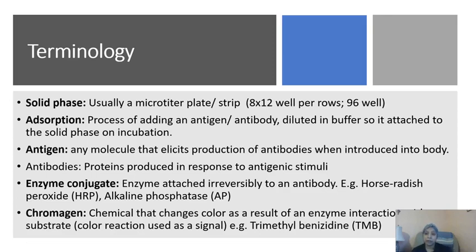So that's the protein of interest in our case, or the part of the protein that we care about. And then our antibodies are going to be the ones that are produced, and that is what we're going to be utilizing to bind to our samples, to look for our protein of interest.